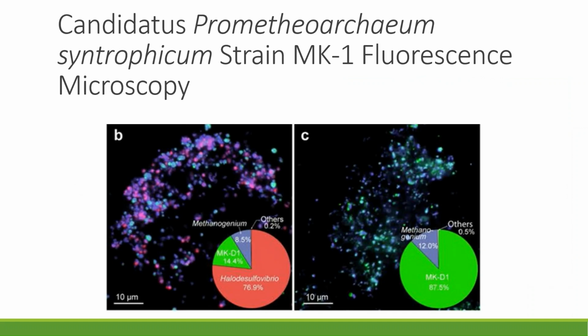In this way, scientists were able to observe which microbes were working together in this community through their cohabitation. Without the color, we would probably do a poor job at identifying which of these little small dots represents which bacteria, which are very small for doing light microscopy. But since each of them has their own unique fluorescent signature, it becomes possible to process and quantify their numbers.